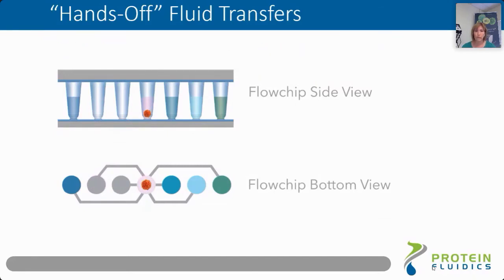Incubate organoid for, again, appropriate amount of time. We can collect supernatant, for example, for analysis of secretion factors, transfer staining solution. Once staining is done, we remove it, and you can wash your sample if needed. Now, at this step, your protocol is completed, and you can proceed for the downstream analysis.